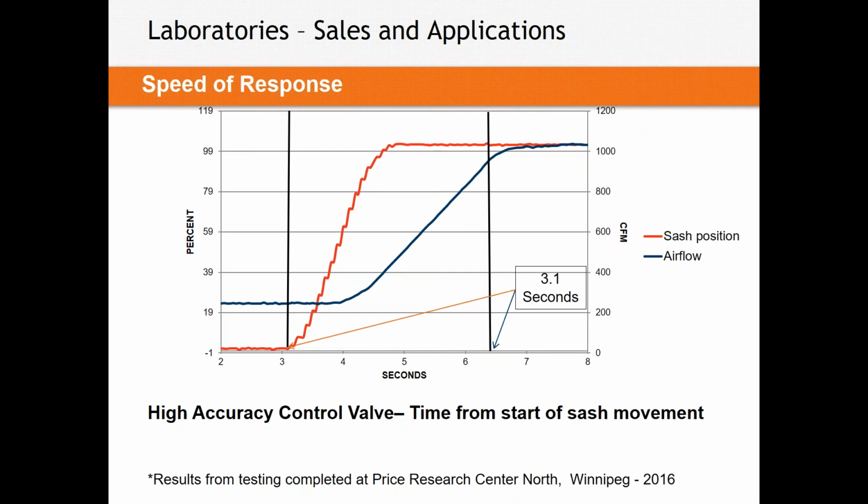All of that being said, these fume hoods can be set up with either technology from a lot of different manufacturers to hit that 3 second or less speed of response. It's very possible. It's done in a lot of laboratories around the world.